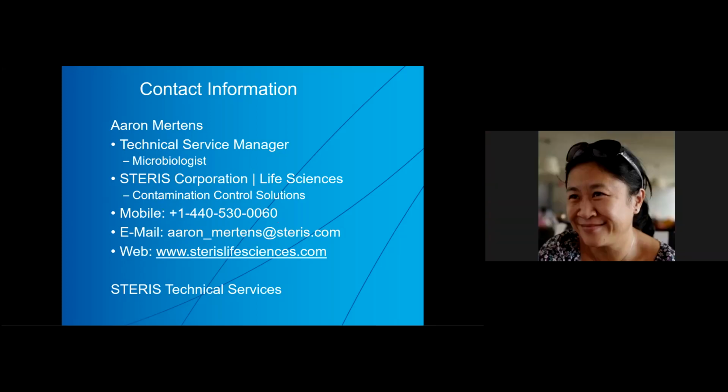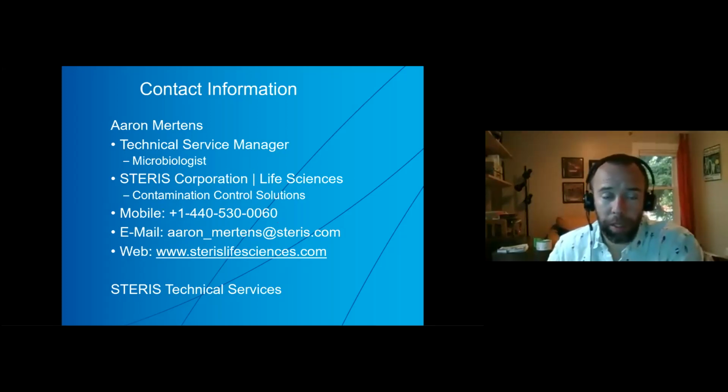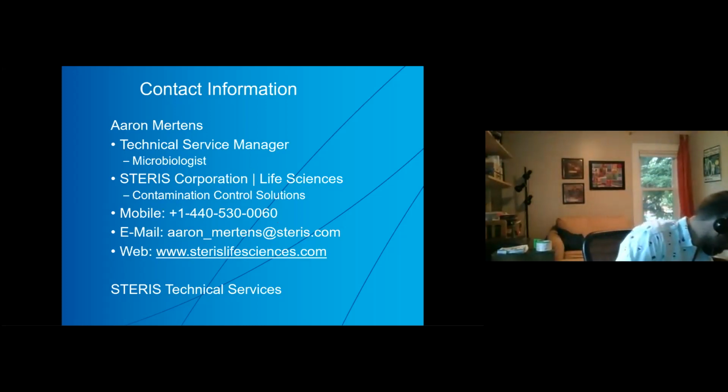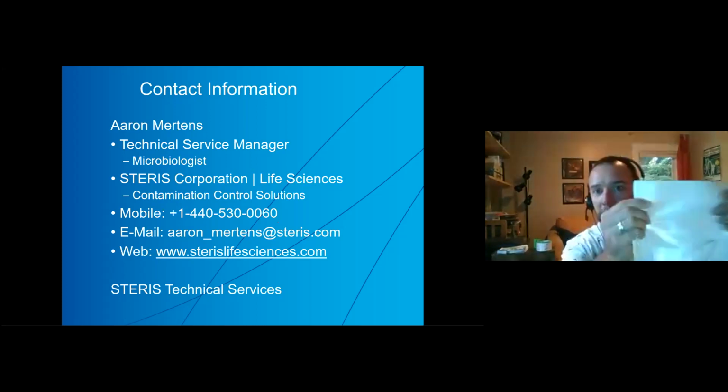So Michelle asks, for wrapping, are companies moving away from autoclave tape and heat setting for bags, only using self-sealing bags? Yes, absolutely. This is the best way forward. I think that autoclave tape and blue cellulose paper wrapping really lends itself to some problems, as I mentioned. The self-seal bags are very efficient and easy to reproduce. The example I have here is in fact a self-seal bag.